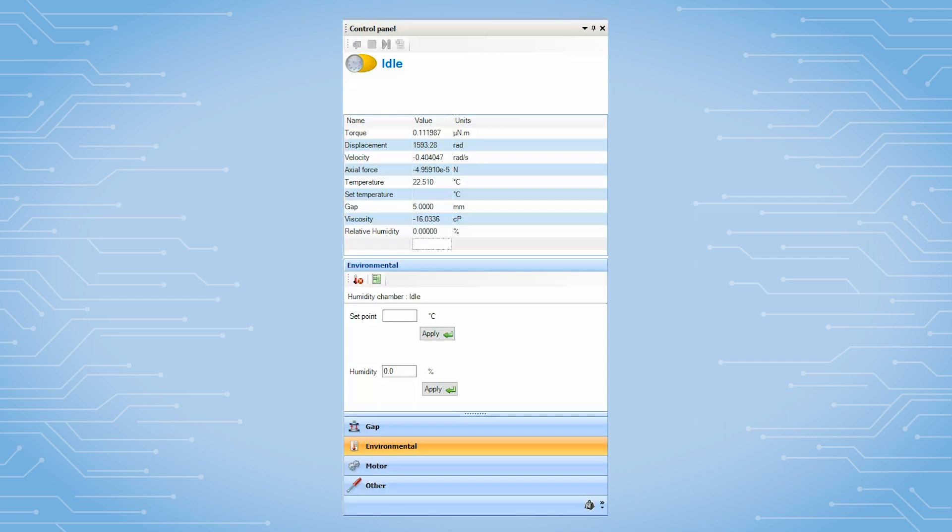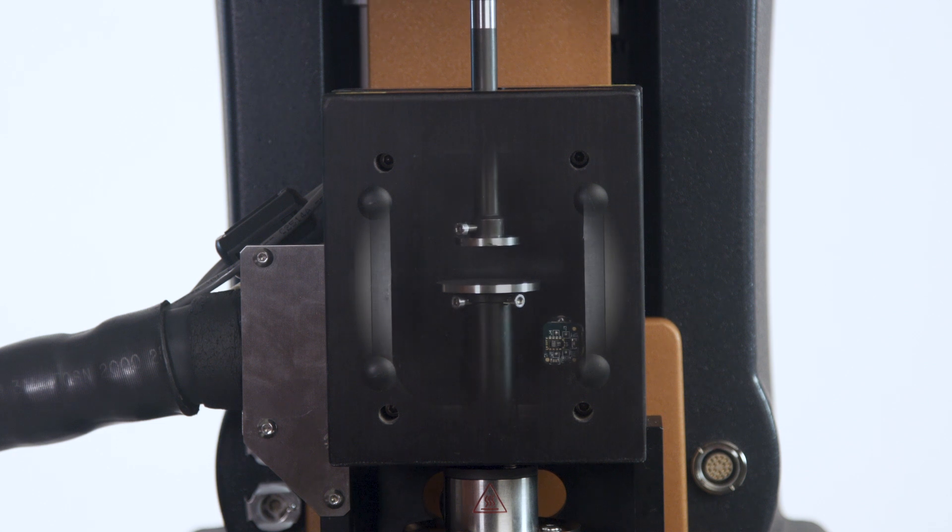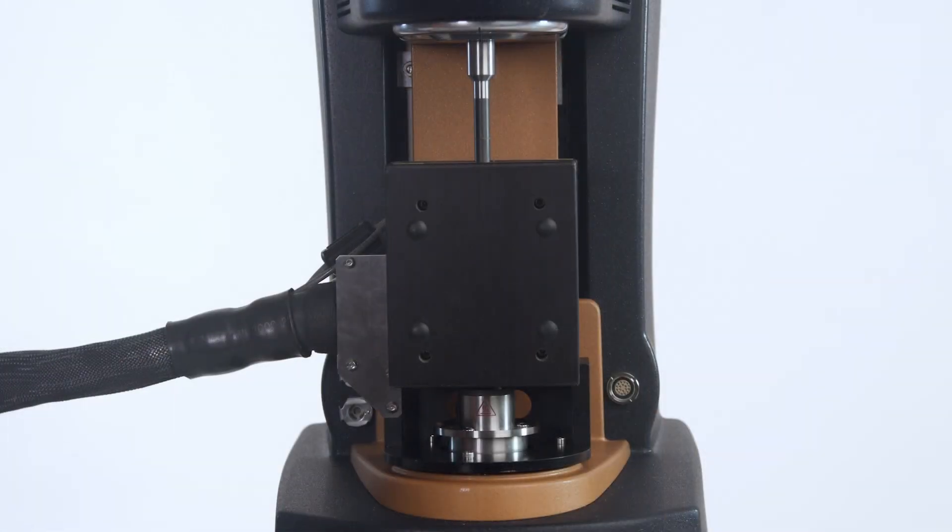From TRIOS software, under the control panel and environment, pre-condition the chamber to the initial test temperature and humidity. After the chamber is fully equilibrated, zero the geometry gap. Now you are ready to create a test procedure. Load your sample and start your test.